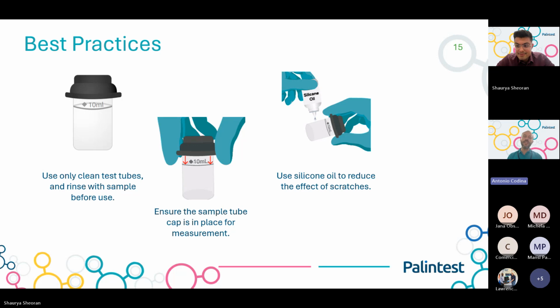Now, when you're looking at 1 NTU, a lot of you probably already do it, but less than 1 NTU is not visible to the eye. It's a sample that you will just look against the light and you are not able to see any particles. Yet the instrument will still detect that there is something there. That is how accurate your measurement has to be.